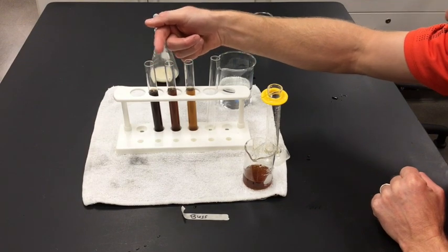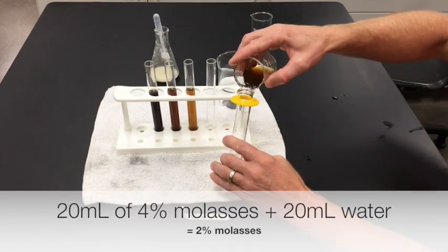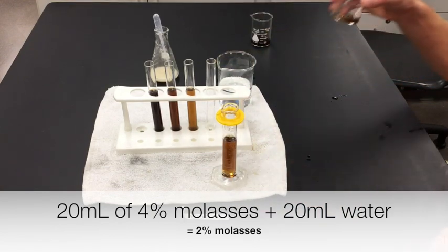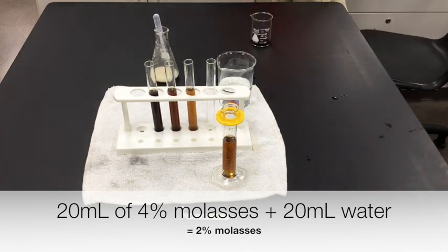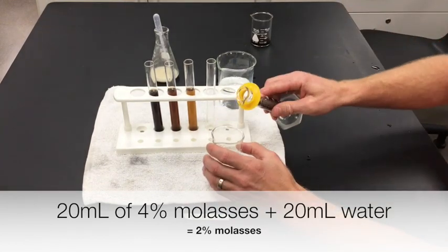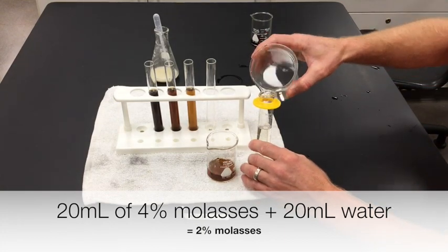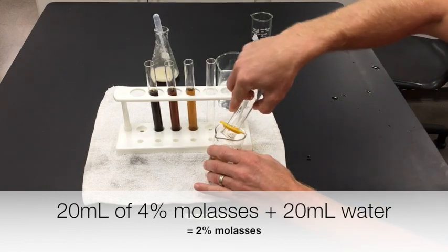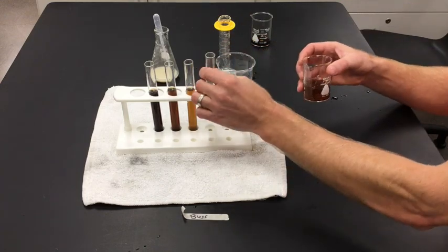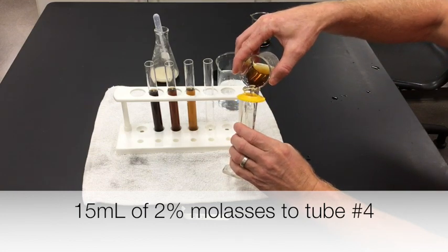So if this was 16 percent, this is 8%, this is 4%, and I want this last one to be 2%. I'm doing the same process — I take equal parts: 20 milliliters of this solution. I'll rinse this out again, and add it to an equal amount of water — 20 milliliters of water — then measure out 15 milliliters of that into the final test tube.